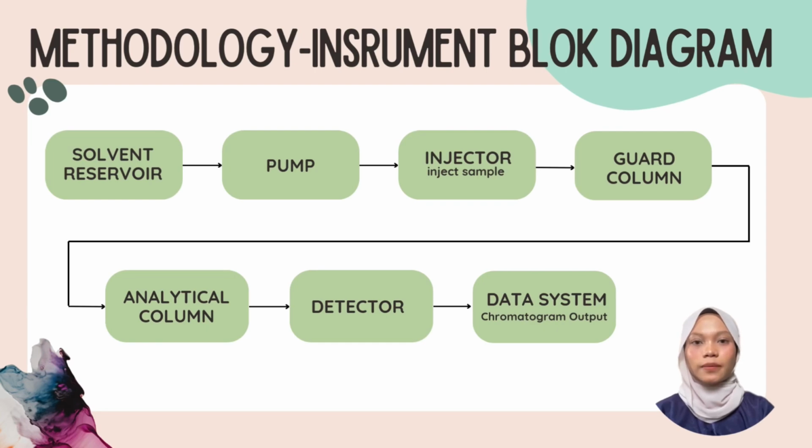Next, I'll be talking about the methodology. First part, I will introduce the instrument block diagram. First, we have solvent reservoir, pump, injector, guard column, analytical column, detector, and data system.